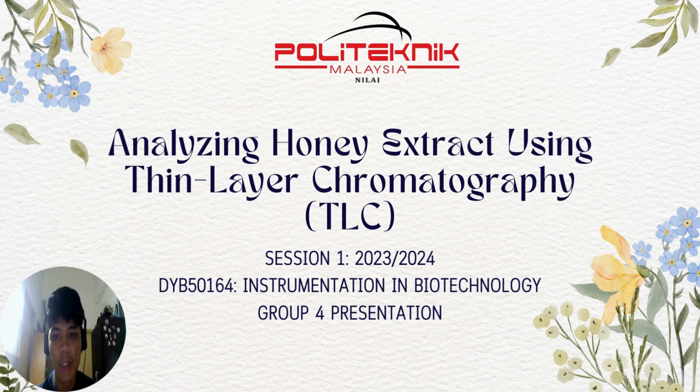Today we are going to be presenting about analyzing honey extract using thin layer chromatography. We have done the research about this topic in the Journal of Pharmaceutical and Pharmacology.